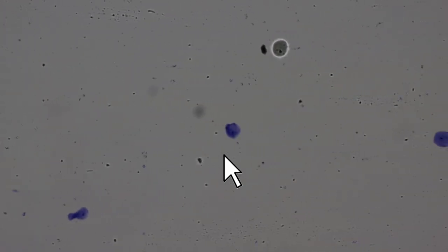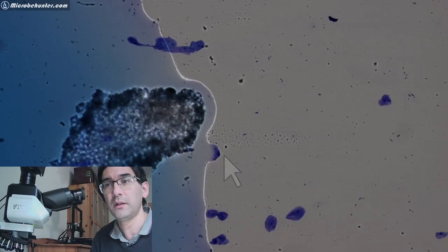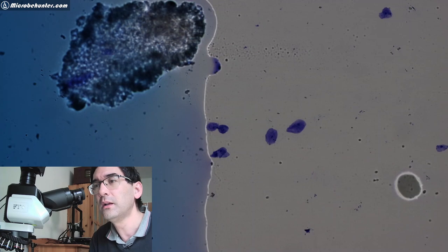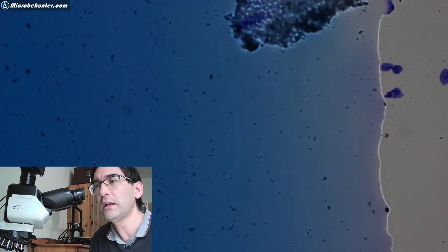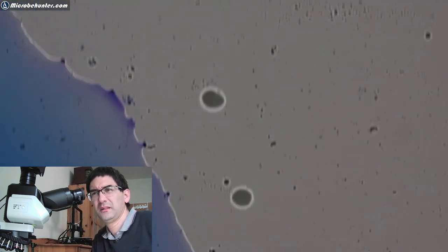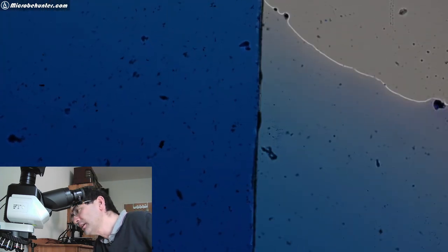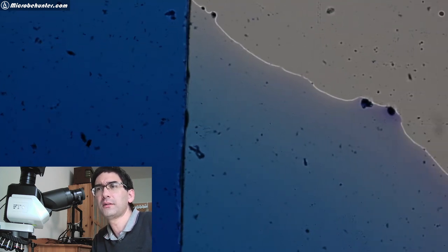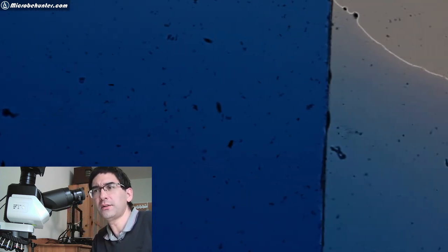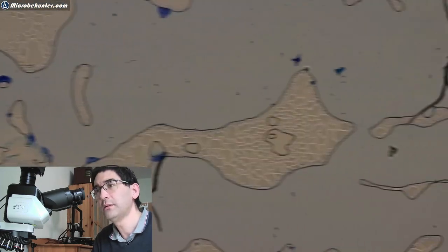Could it be that there are some kind of fumes maybe, that the methylene blue kind of evaporated and stained the cells? No, I seriously cannot explain this, okay? But you see that on the left side here, this is where the liquid is. And it seems to stain the cells even though it did not reach them yet. So this one over here, this is the side of the cover glass. Okay, so we're now basically outside of the cover glass here. This is strange. Honestly, I cannot fully explain.